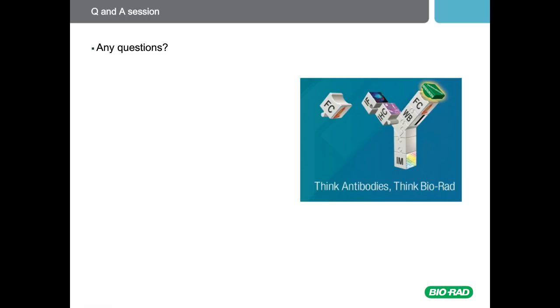So thank you for that. We have some questions that have come through. And the first question we have is, there are times when I recover red cells from the interphase of a Ficoll. What is wrong? Well, quite often when you have red cells at the interphase, there's a few reasons why this can happen. First of all, make sure the brake is off when you centrifuge. You have to make sure you have a good separation of your layers.